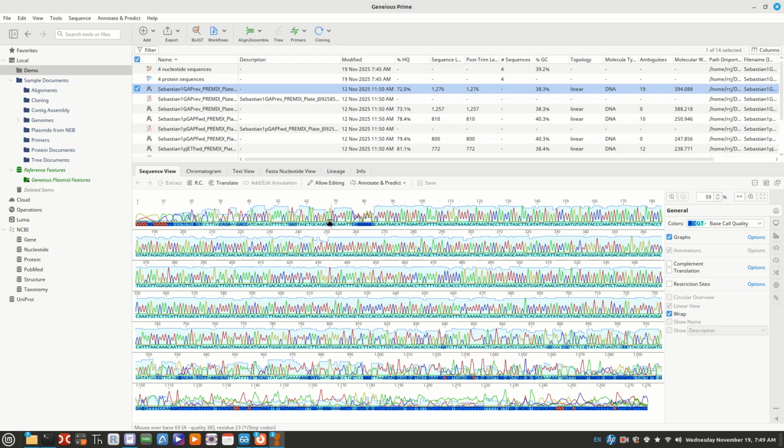As long as it has a peak and it's clear and there is not another peak, it's a perfectly good read. It can be tiny peaks, but like I said, the thing you don't want is an ambiguous one, where right here it's red and yellow, so you don't really know what it is. Here it's both, and ambiguous reads you do not like.